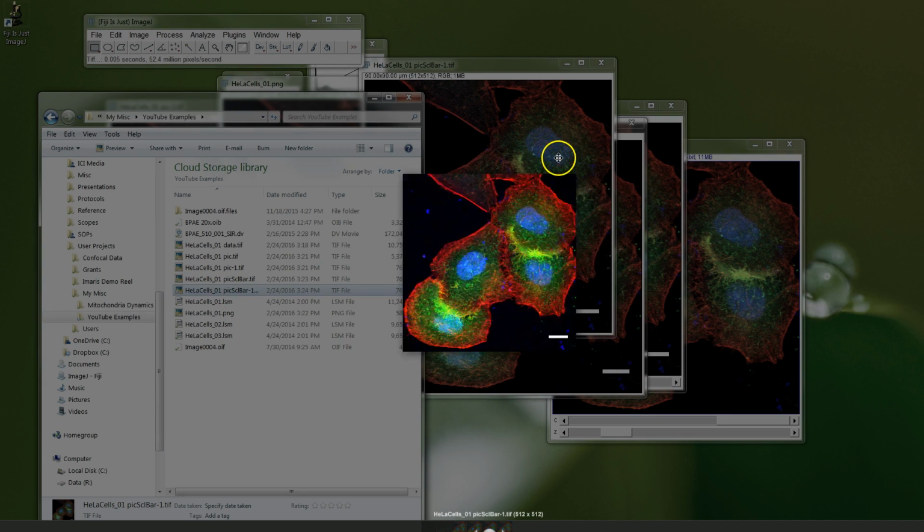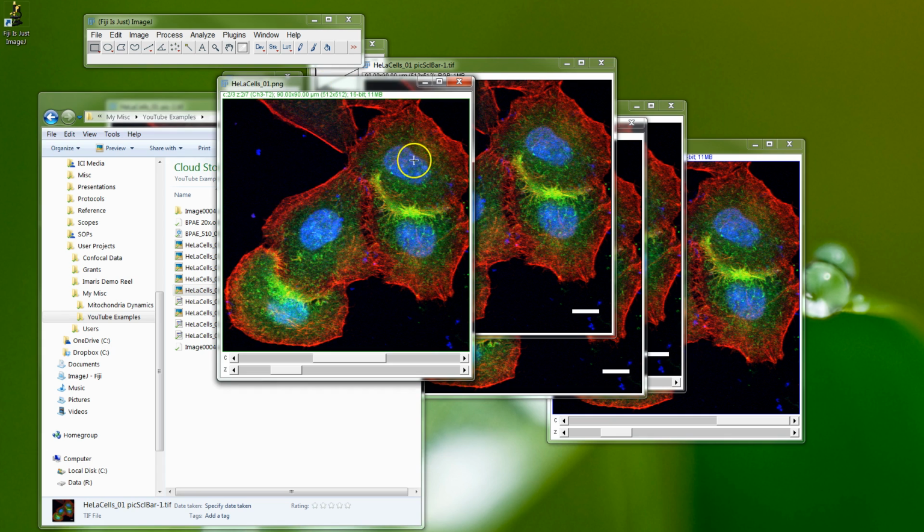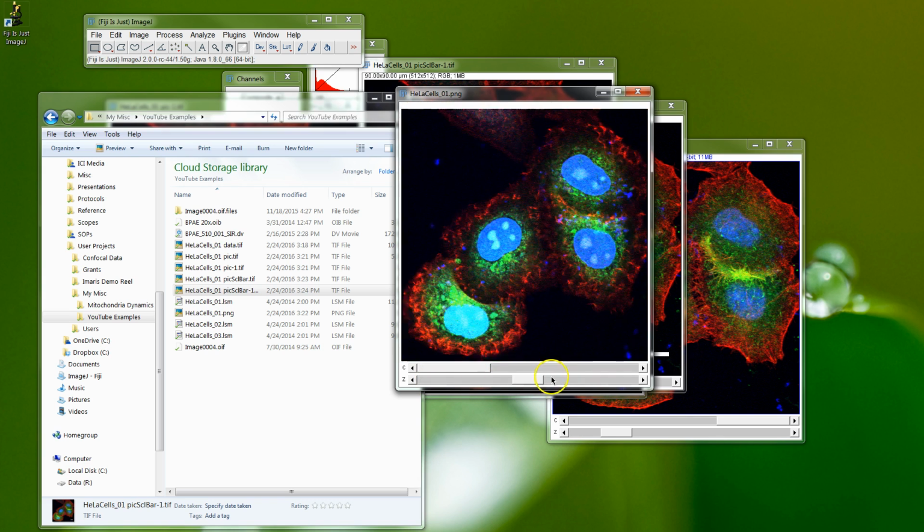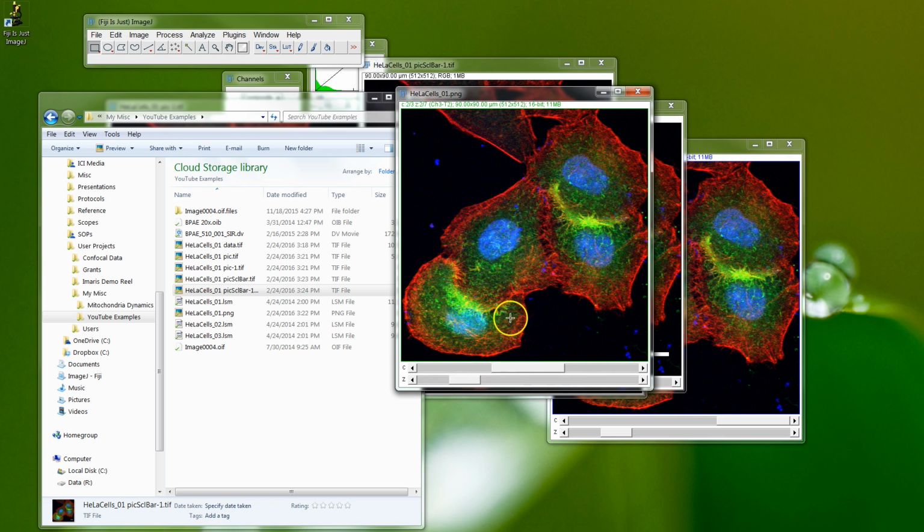Okay, so all these steps are a pain. Again, with the PNG, I personally just like it. So one thing to note here is change the file name to .png, but the data itself hasn't changed. It's 16-bit, it's 3-channel, and it's 7Z. So it's still actually the original data set. It's changed the file name when I've saved it. So watch out for that too. Don't let that mislead you. It's not PNG. Only the file that I saved was a PNG.